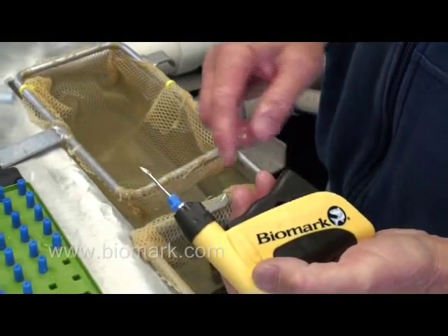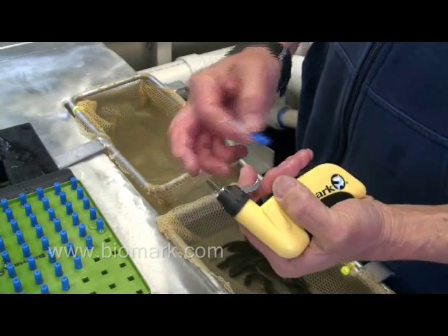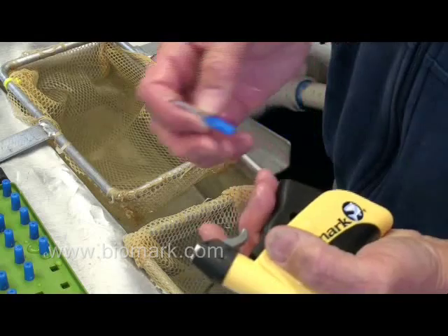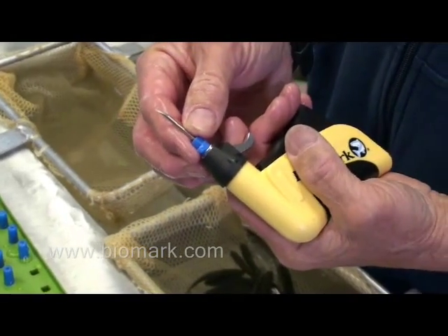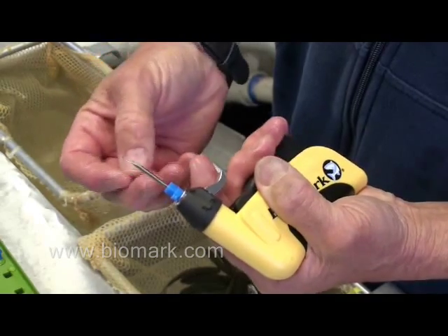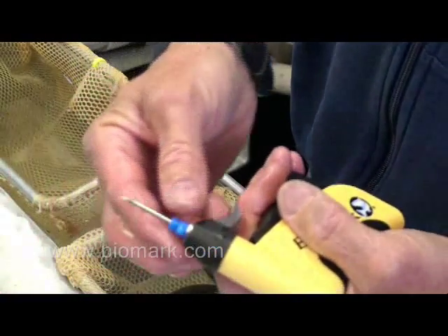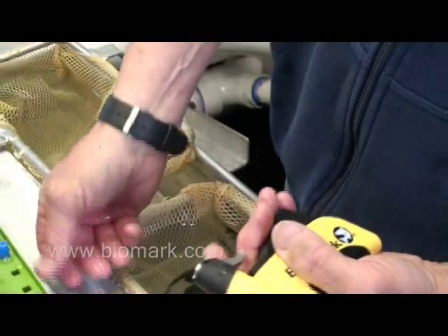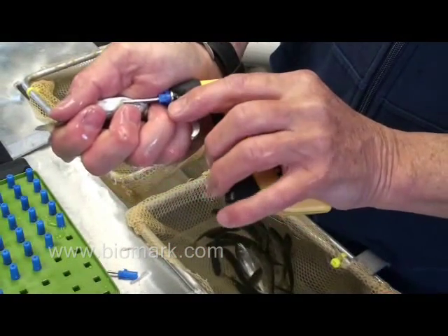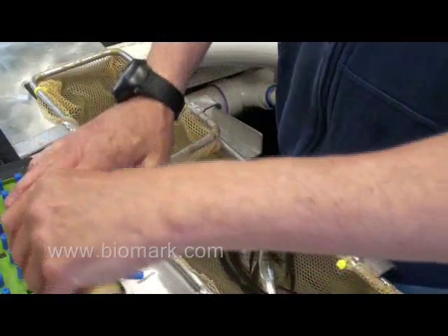We use a MK-25 implanter with preloaded needles. The MK-25 has a push rod built into it, which is activated by the main trigger. The preloaded needle has several parts: the tag itself, an internal push rod, and an ejection trigger that ejects the tag. The process is to take the fish, use your fingers to implant the tag, and use the trigger to eject the needle from the gun.